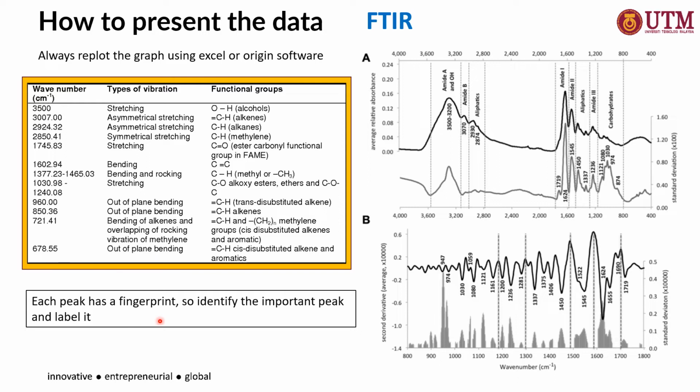For example, if you have different paint coatings, if you study corrosion, right? If you blend two different polymers and you want to replicate the original paint, FTIR can become like a fingerprint, which means that you can obtain the actual paint composition by using FTIR.